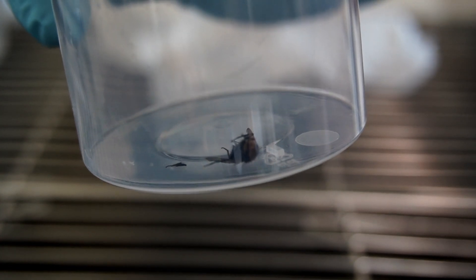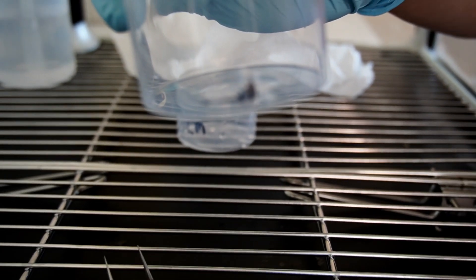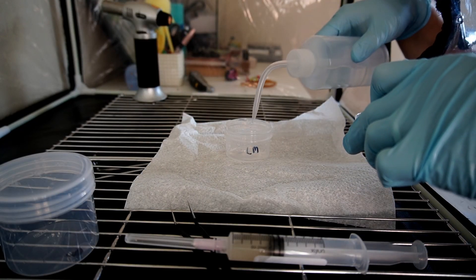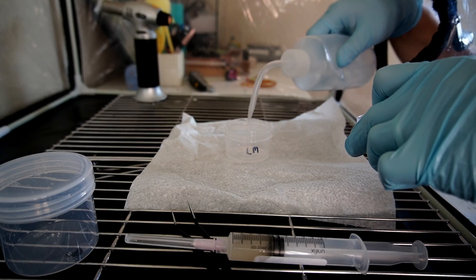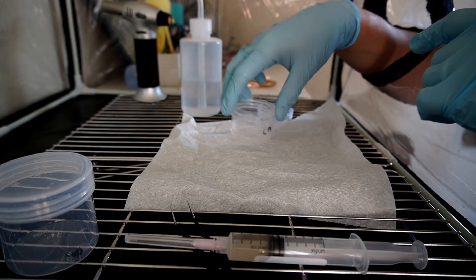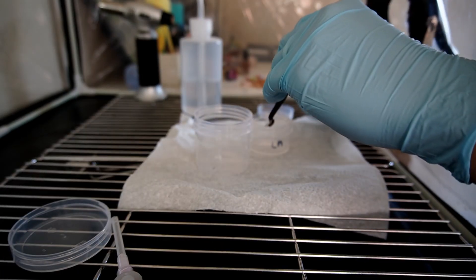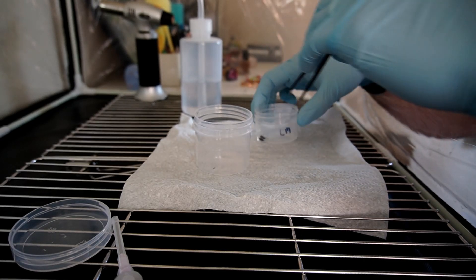I moved the fly into my still air box. I gave the fly a bath in alcohol, just to get rid of any germs that might be on the outside. I'm not really sure if it's necessary but I did it anyway. I also cleaned the container with alcohol and allowed the fly and the container to dry. And then I inoculated the fly with Cordyceps liquid culture.